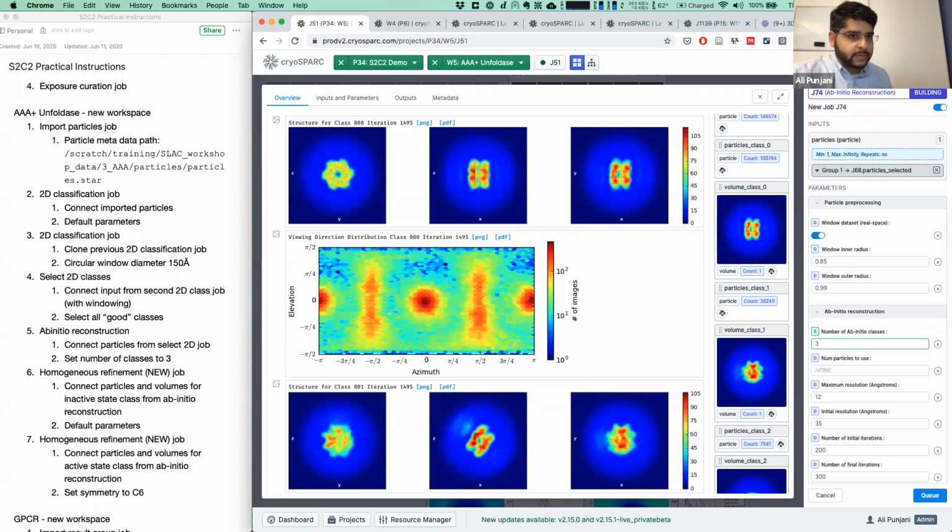On the other hand, when you enforce the symmetry, you get that many times more statistical power to resolve the structure that is conserved around the symmetry. So for example, in the case of the proteasome, or this 6-fold symmetric structure that we solved today, we enforce the symmetry, knowing that the structure we get at the end of the day is going to be symmetric, but every particle will count 6 times more than it did before in terms of signal. If there was some symmetry breaking that we wanted to observe, we shouldn't have enforced the symmetry. So at the end of the day, it's a trade-off in your biological context. How sure are you that the structure is symmetric, and how interested are you in symmetry breaking that may have occurred?